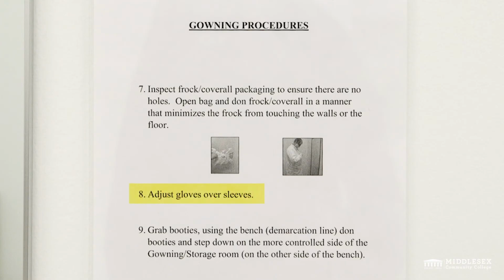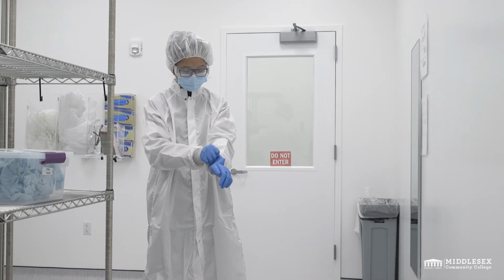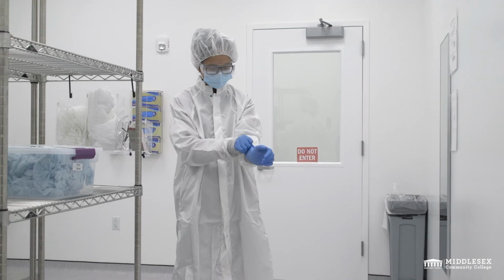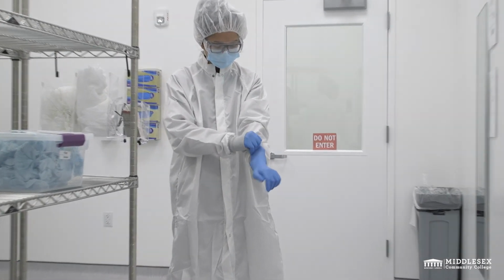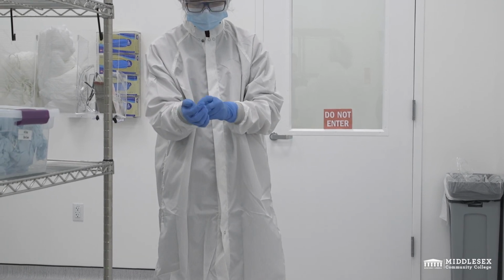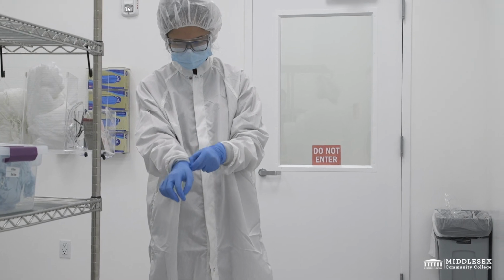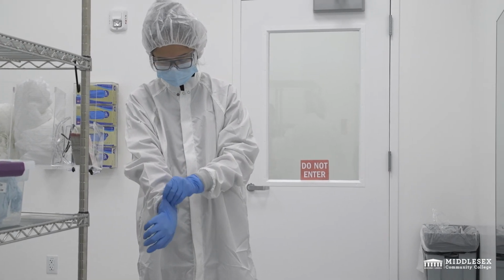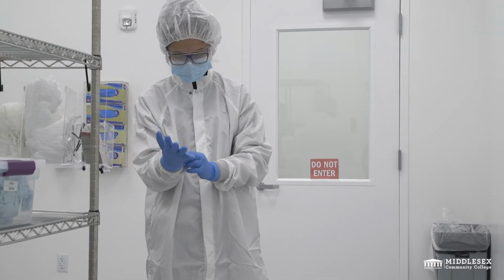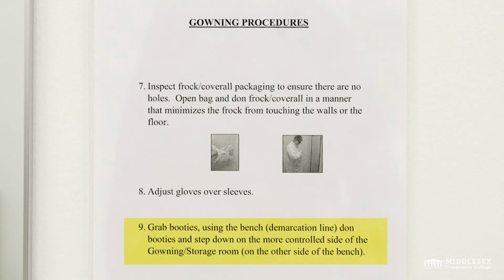The next step requires you to adjust your gloves over your sleeves. Grab your booties.